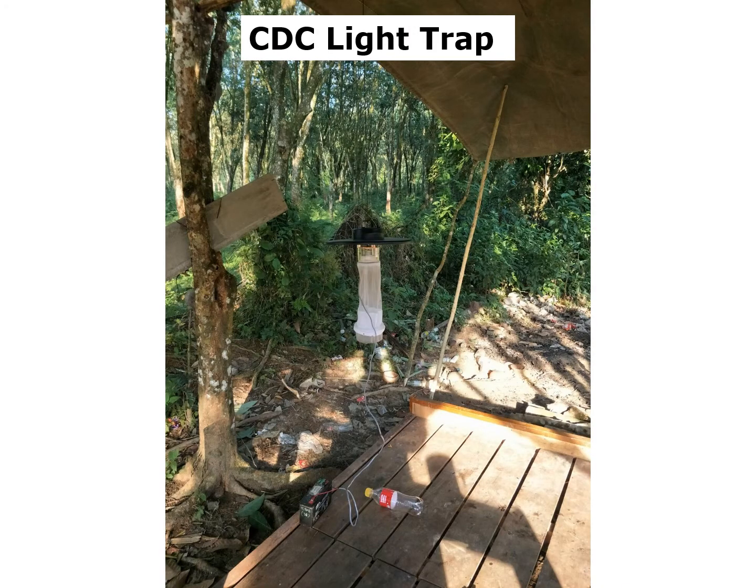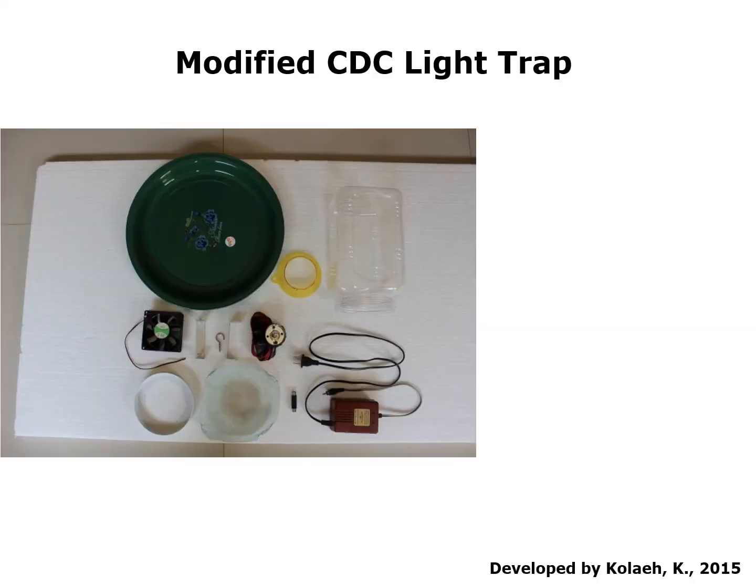The investigation of Leishmaniasis requires the use of traps to collect sandflies. Usually, the CDC Light Trap is used in sandfly collection. However, the CDC Light Trap has several limitations. This device is not widely marketed and the price is rather high. Furthermore, the collected sandflies will be dead. To tackle these limitations, an adaptation of the CDC Light Trap was developed.